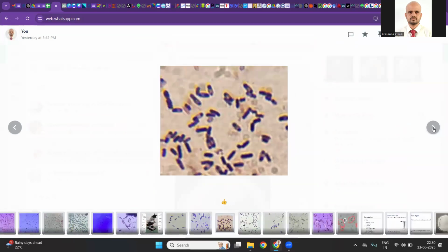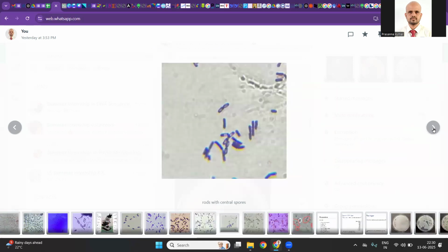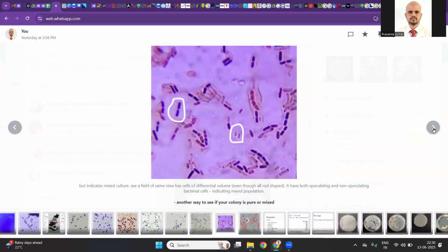Very good. These are the clippings I have trimmed out. Okay, you don't need to keep the entire trimmed picture. Make sure all the dull cells or contrastless cells are removed. How to remove this? Just focus on the core region of the view. You will have cells with better sharpness. Okay, always at the core region. This is what I told.